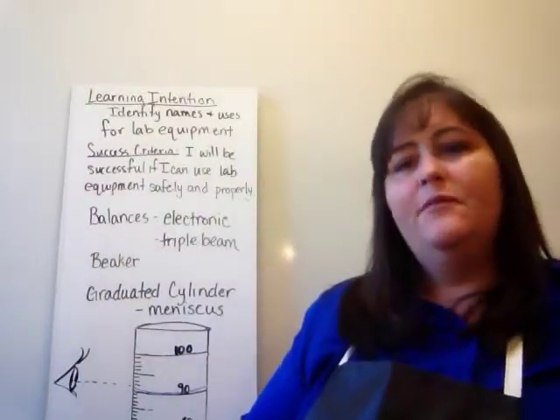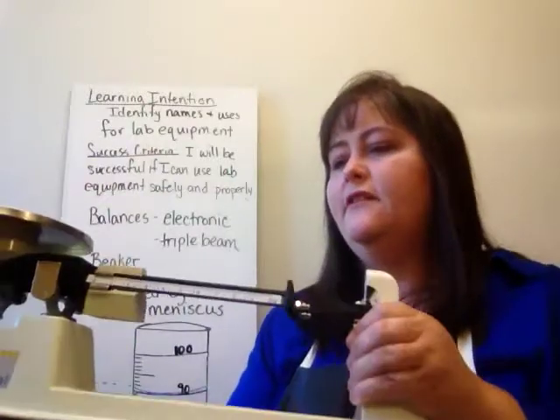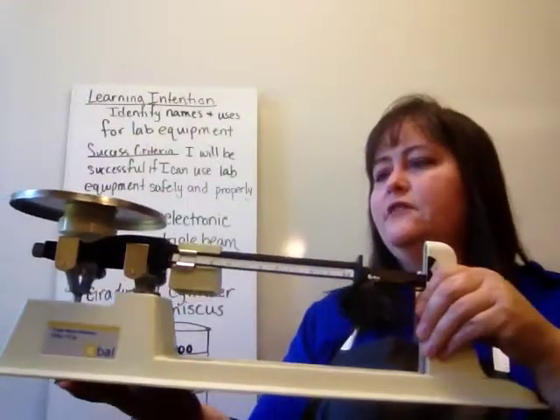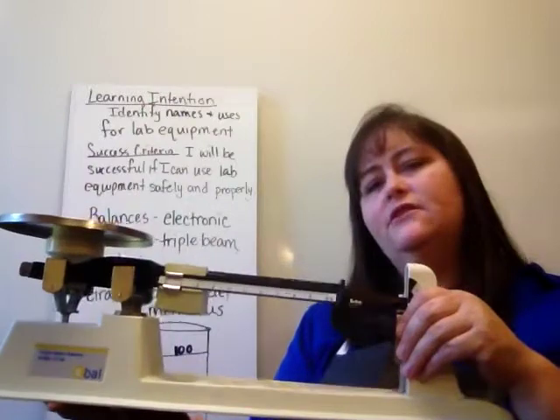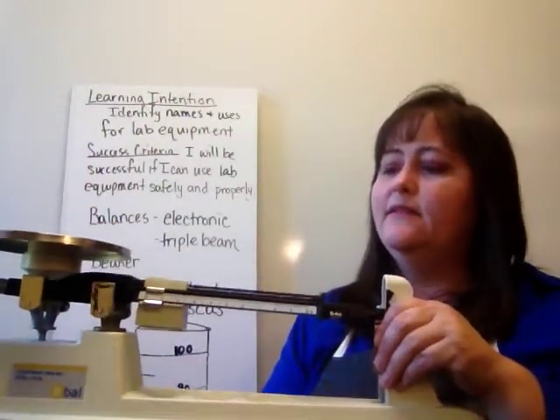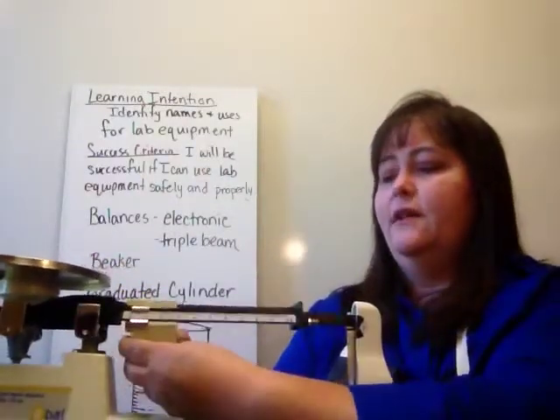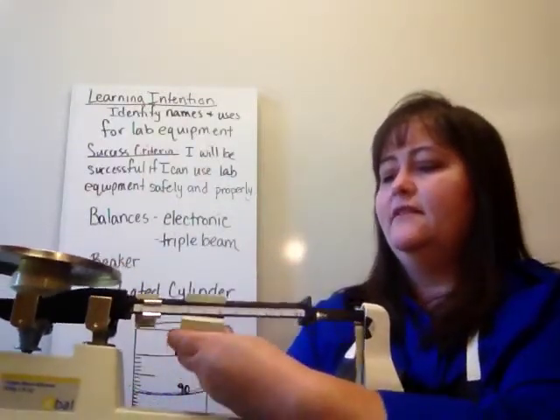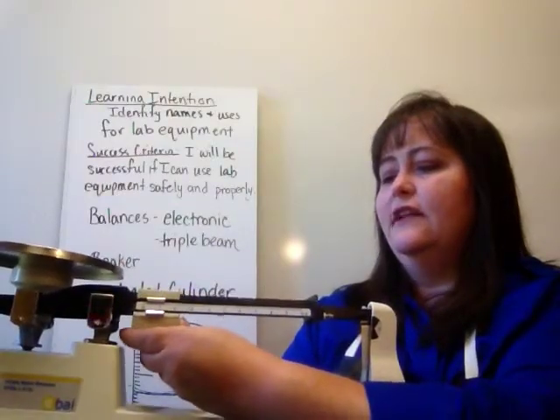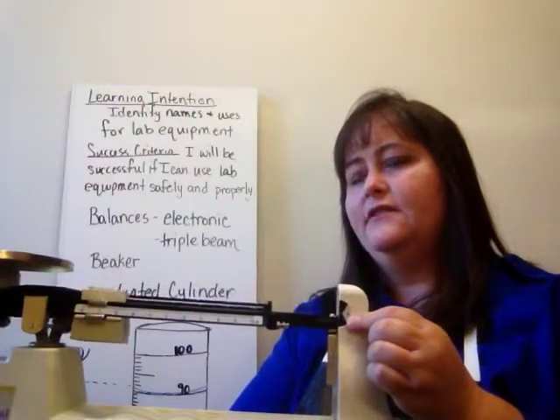The other type of balance is called a triple beam balance. You've probably seen one of these before. It's a little more complicated to use, but it's good for measuring larger masses. We don't use electronic balances for large masses, but when we have a large mass, we put it on a triple beam balance. You can measure it by putting it on the plate, just like with the electronic balance, and then moving these masses until it actually zeroes out over here. And we'll have another lesson on how to do that.